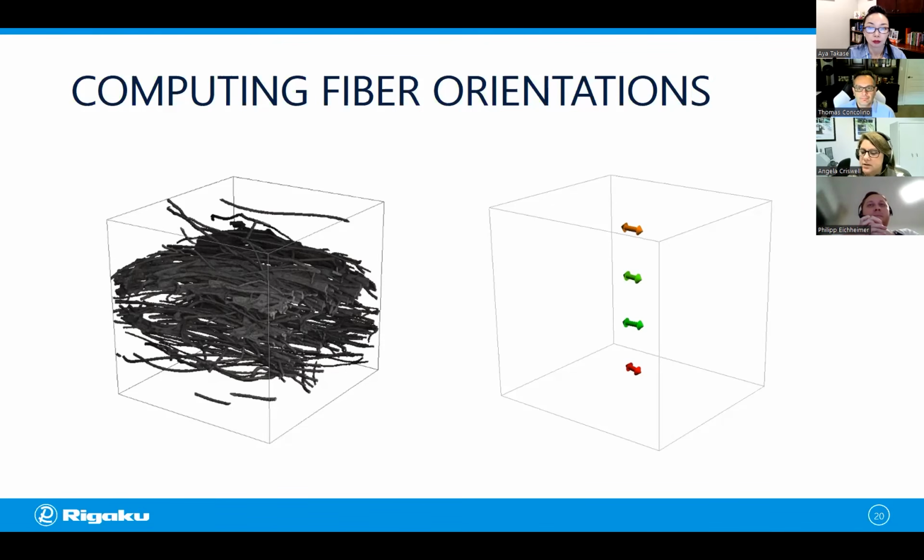One of the things I'll just mention about that: by default, GeoDict will try to determine what your block size should be. But I noticed you can modify that and customize it if you want to. I just let it use the defaults in my case.